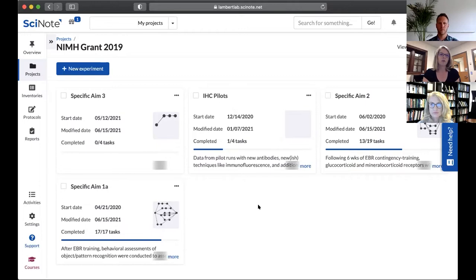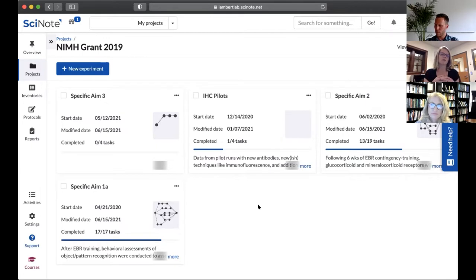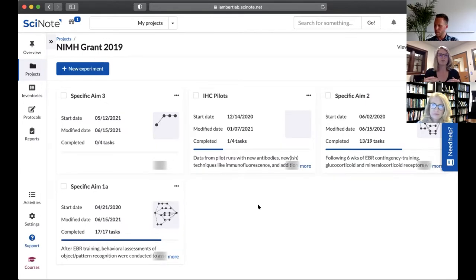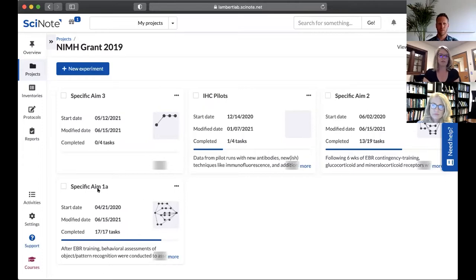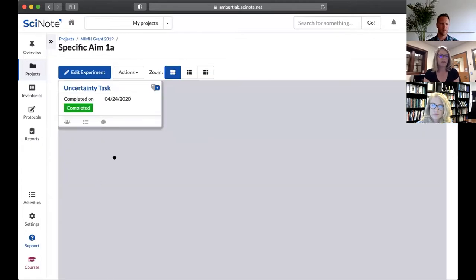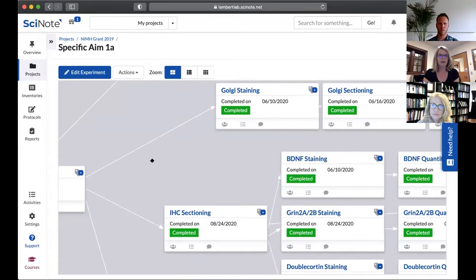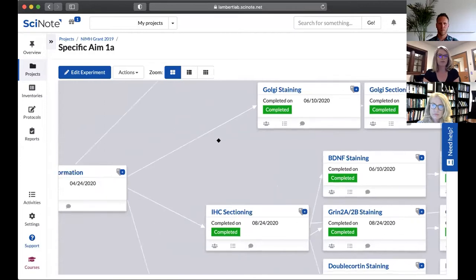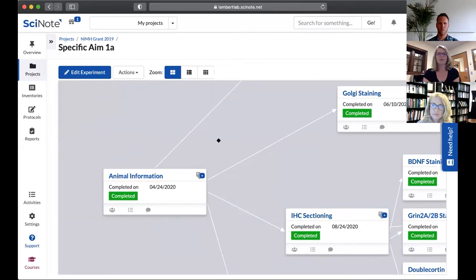Most grants, as you know, are typically split into different specific aims. So even though I have one project being this grant project, I have different sub projects or experiments that are named based on the specific aim in which they are encompassing. Specific aim one here is one of our first forays into kind of adapting SciNote into our lab and the way that we work.